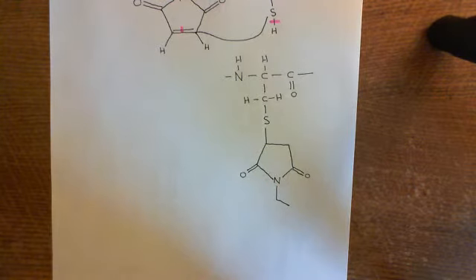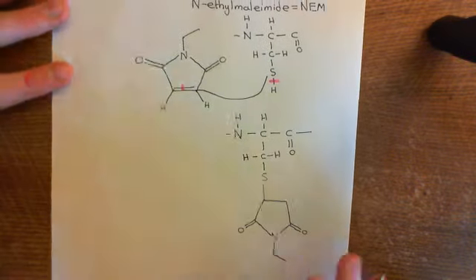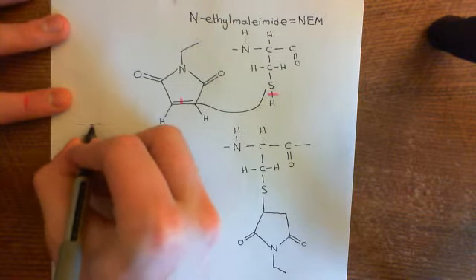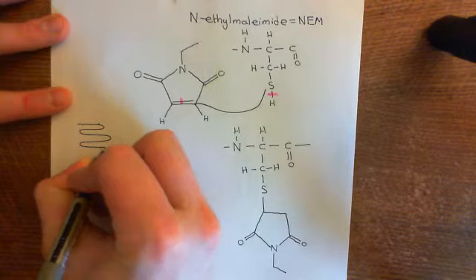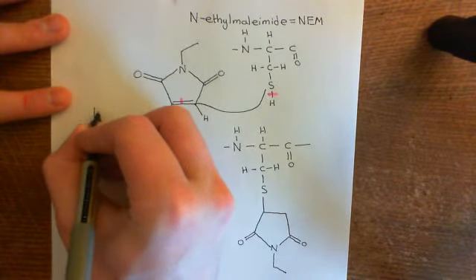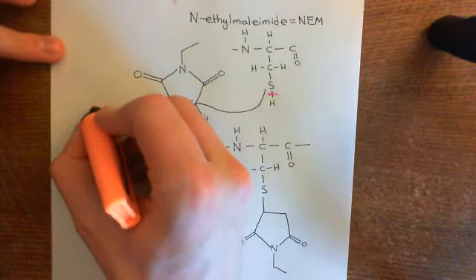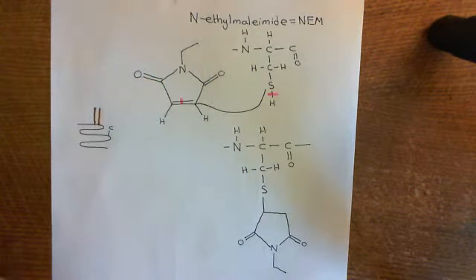So when we mix the N-ethylmaleimide with our proteins, let's draw our proteins out again. So we had protein A here, and we had a free cysteine residue here, and we had 2 cysteine residues here which were palmitoylated. Of course, you'll have far more cysteine residues than that in the protein, but to get the point across we only need 1 cysteine residue.